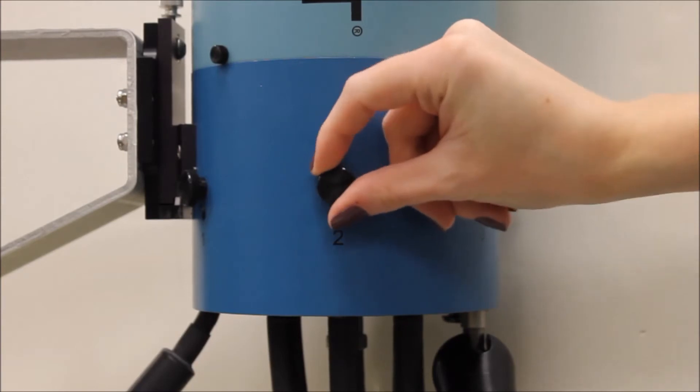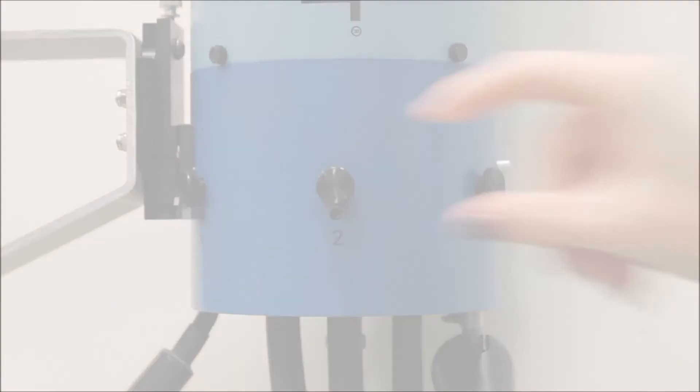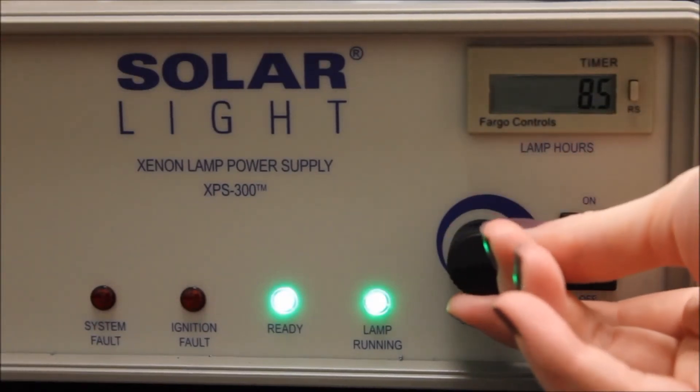The output intensity is rated up to 4 MEDs per minute and can be adjusted by the occulter knobs on the simulator's chassis as well as via the included XPS300 power supply.